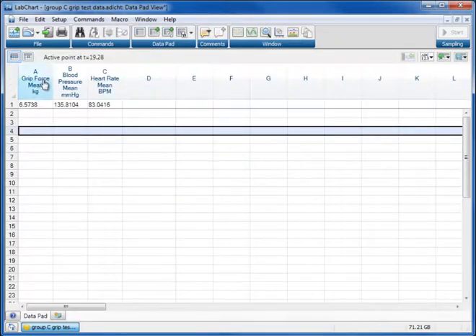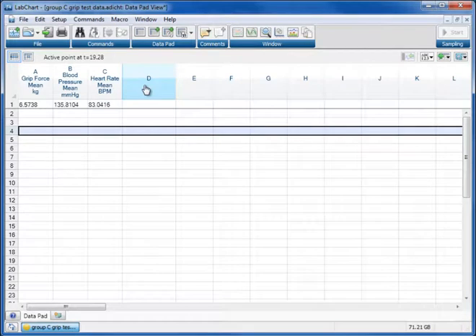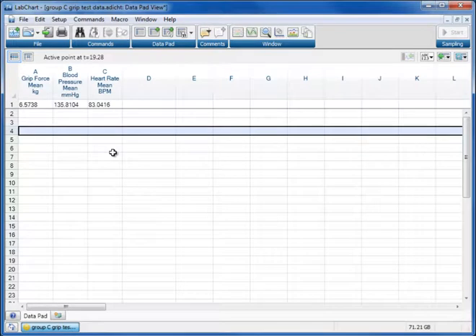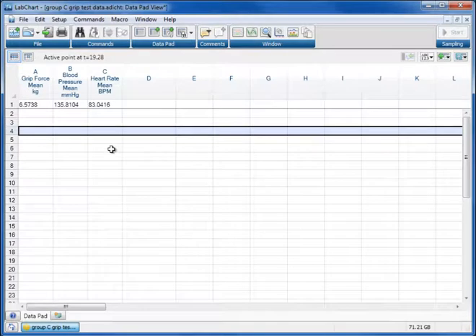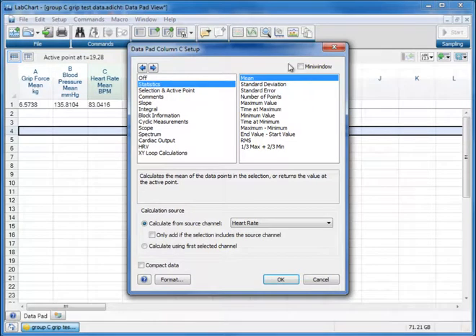It's a series of rows which represent data acquisition and a series of columns which represent data that you are looking at. We've got grip force, blood pressure and heart rate for instance. Let's say we want to see the heart rate mean on the screen as we're doing our analysis without flipping between the data pad and the chart window. So we can click on the heart rate mean, and right at the top here you've got a little thing that says mini window.